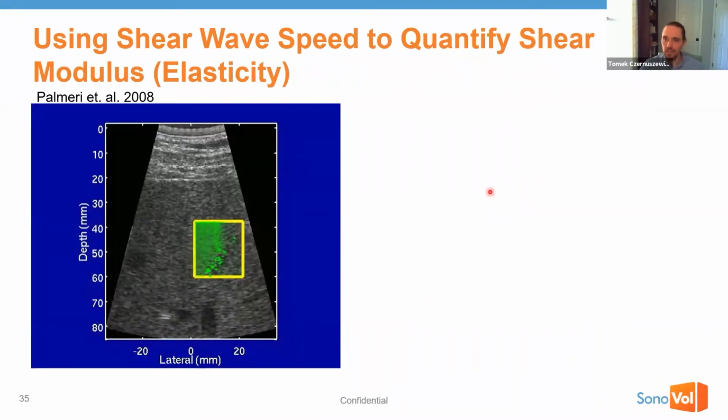Okay, so that's what elastography is, where we're essentially trying to quantify stiffness and use that to infer disease or pathologic state. So what's the shear wave business that we were talking about at the beginning of this? Well, it turns out that it's not trivial to map the stiffness of a tissue with an imaging modality. The shear wave is one approach, and is probably the most dominant approach used in the clinic today because of the advantages it has over physically compressing the tissue by hand.